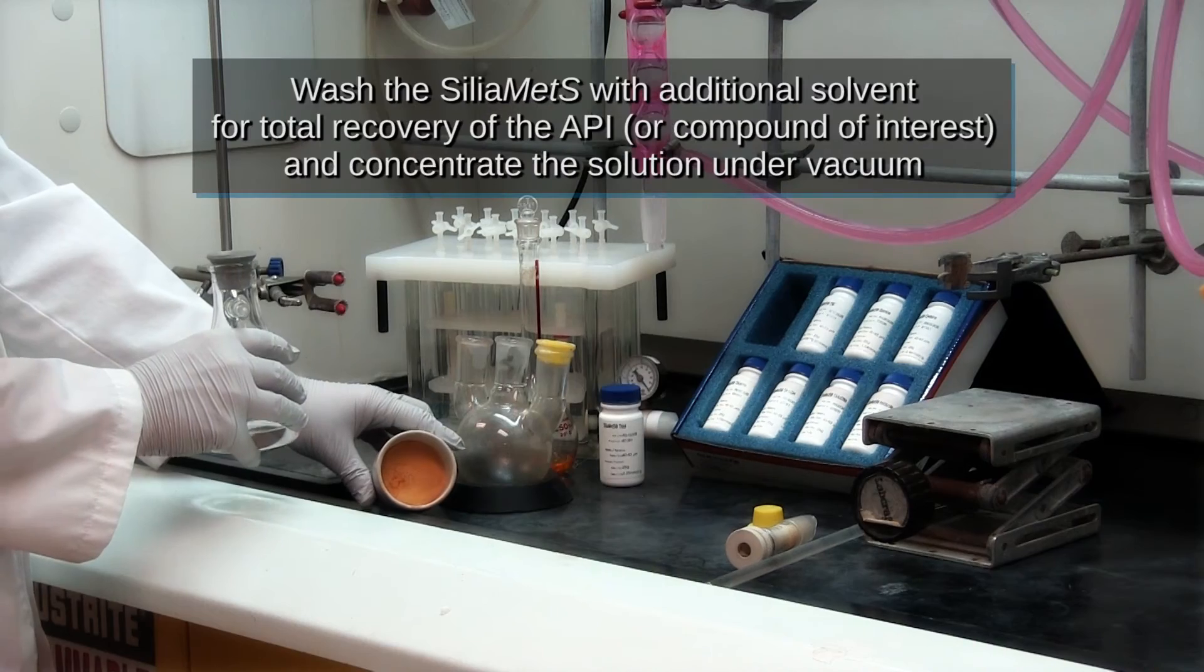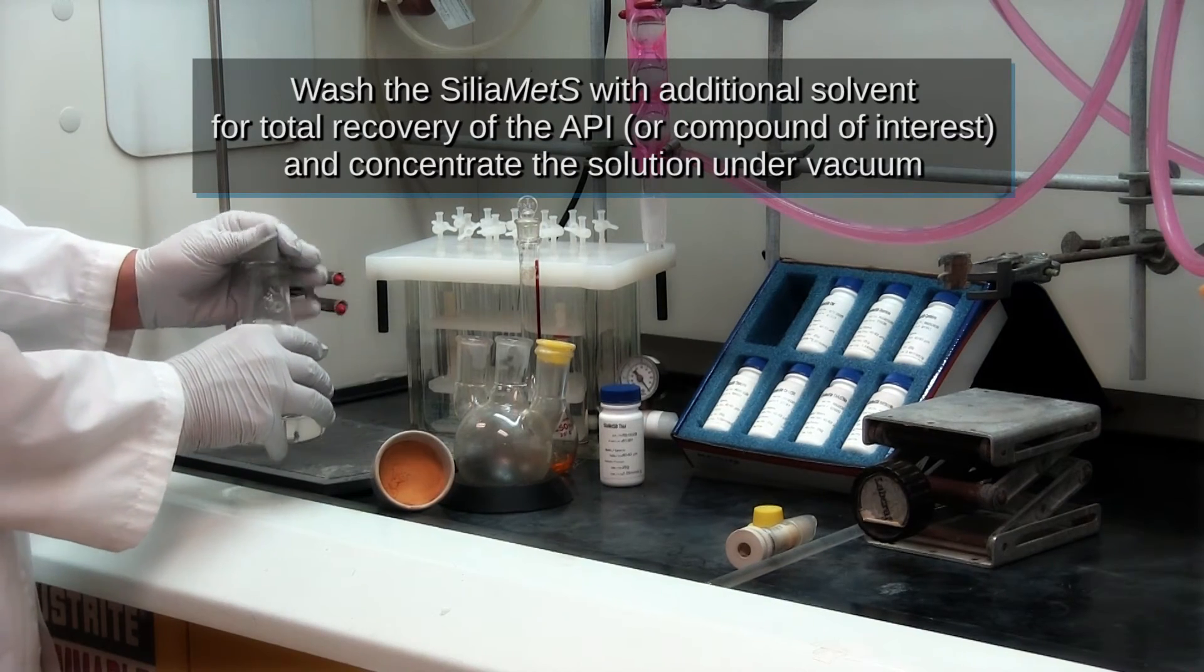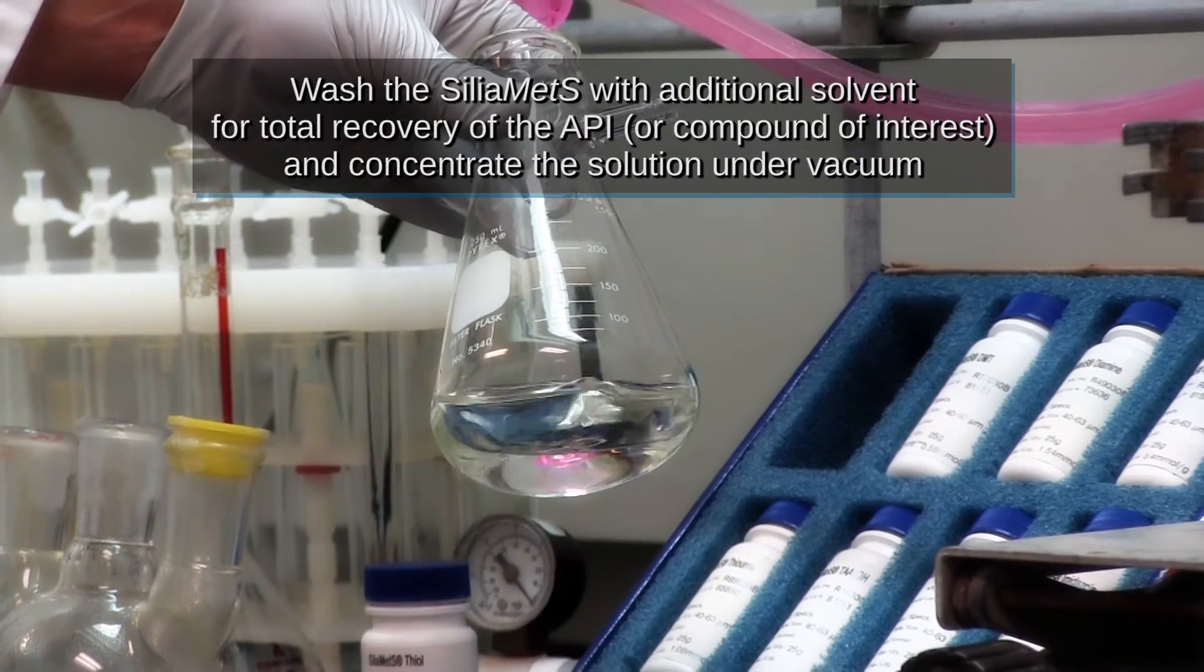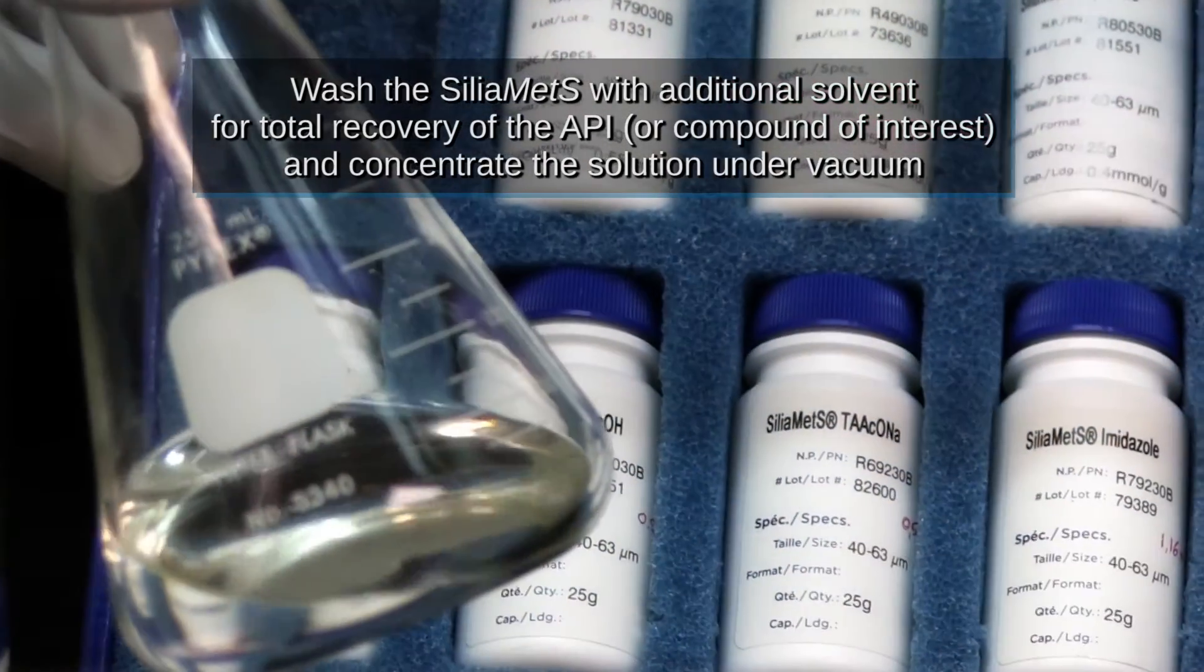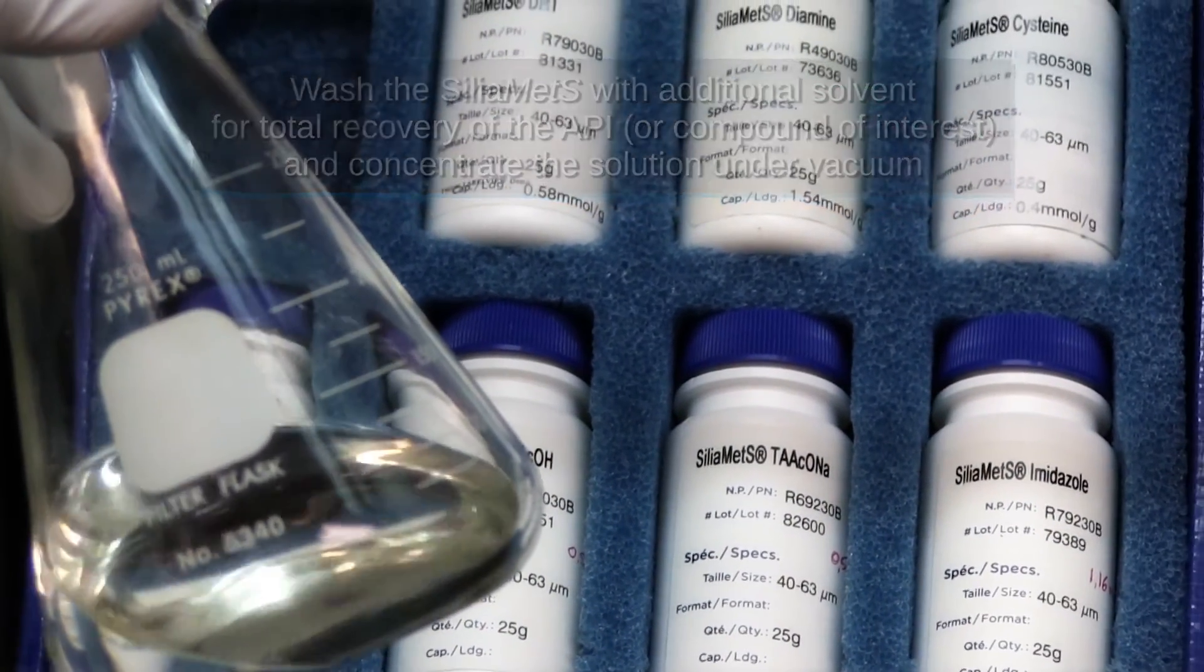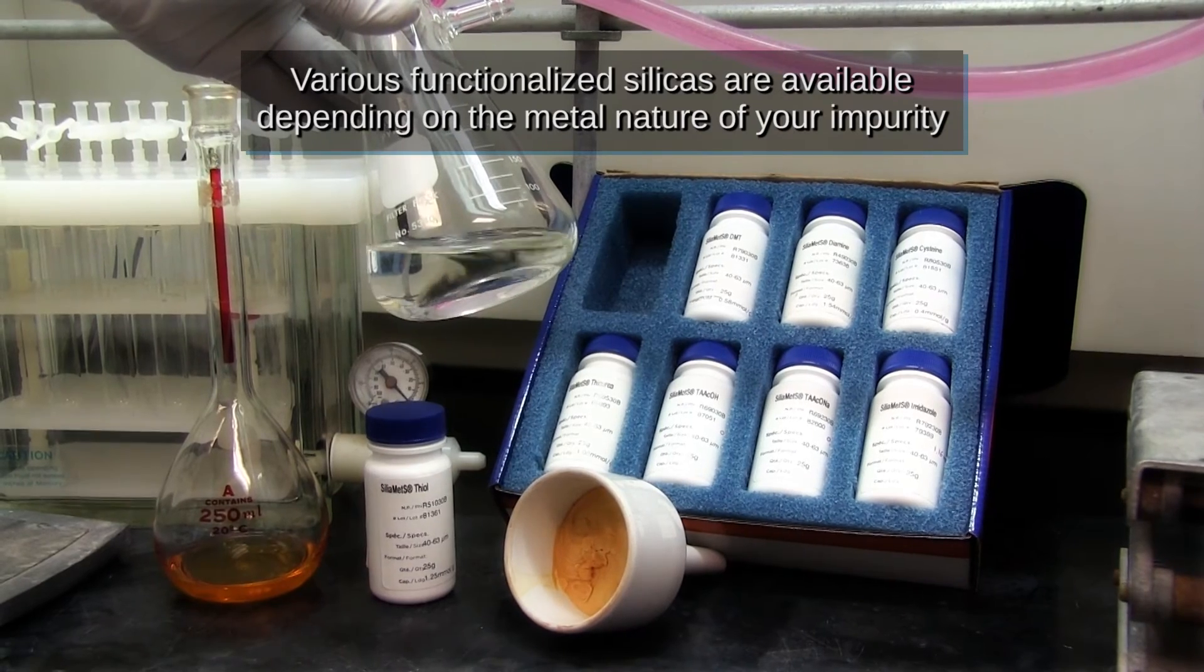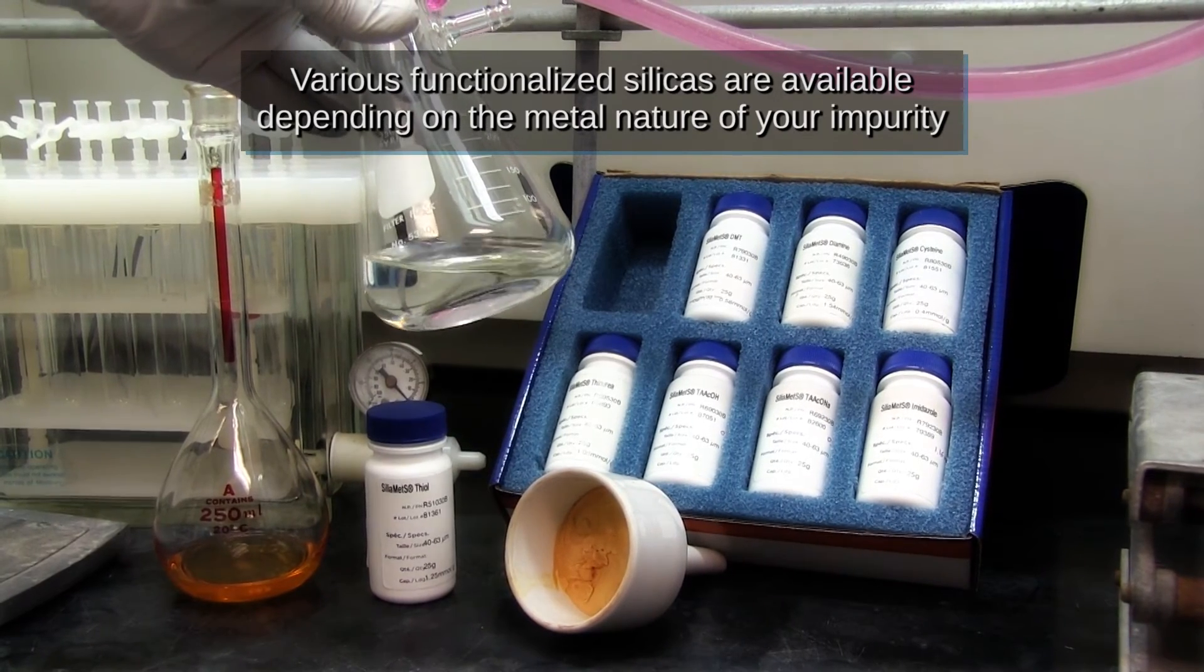Wash off the scavenger with additional solvent for total recovery of your API and concentrate the solution under vacuum. Various functionalized silicas are available depending on the metal nature of your impurity.